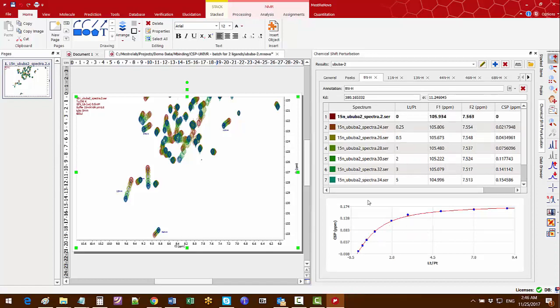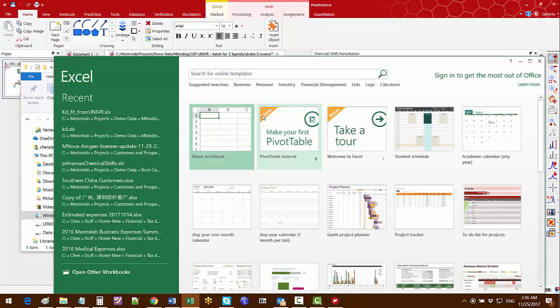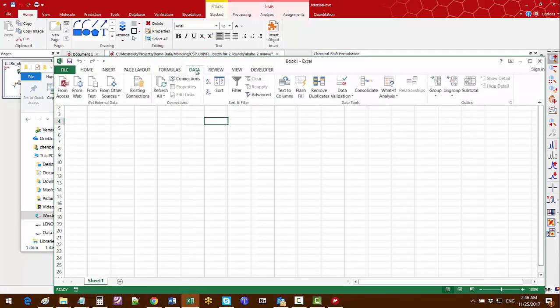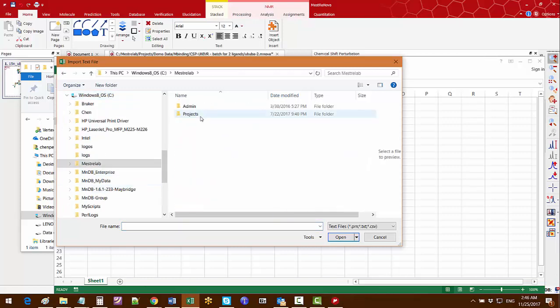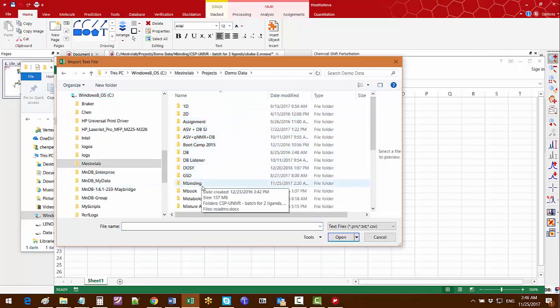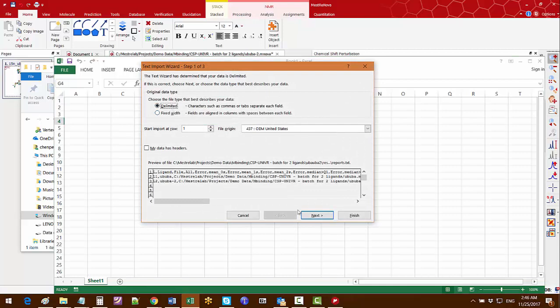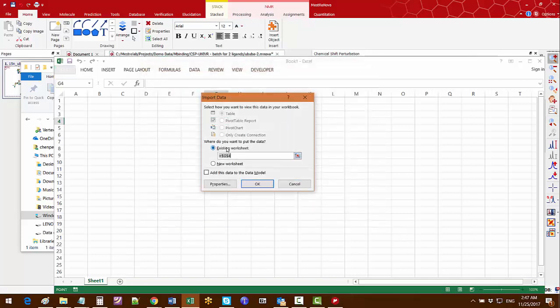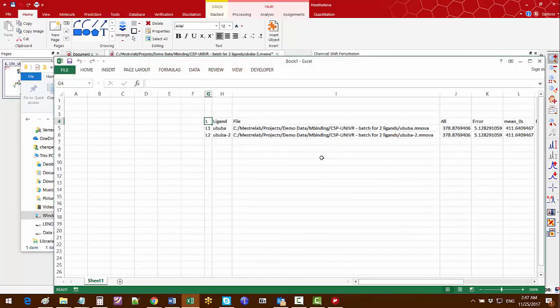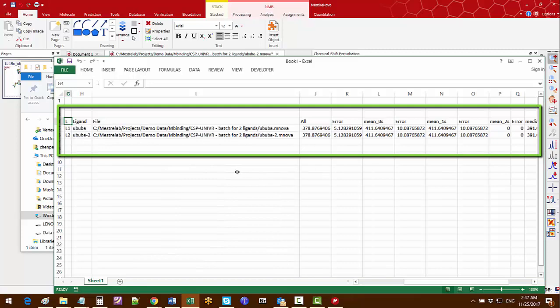To view the general results for the whole batch processing, you can go to the folder where the report text file was specified and open it using Microsoft Excel, using the Data > From Text command to open that report text file. Make sure you are using commas as delimiters. The results are all listed there, including the document for each ligand, the average KD, and the other statistical analysis results.